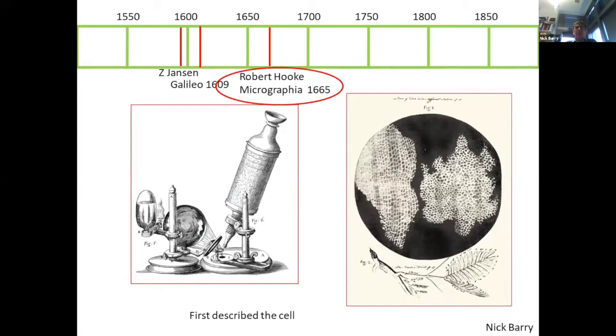With Hooke, this was really a landmark. This was a person looking into a world that no one was aware of. This really was the advent of microscopy as we would understand it in the biological context. And his output was drawings. He has a big book, Micrographia, full of these beautiful sketches he did. And he was the person who described the cell.